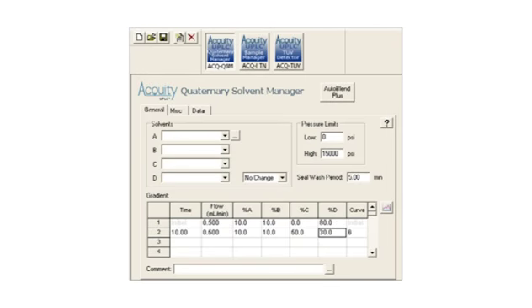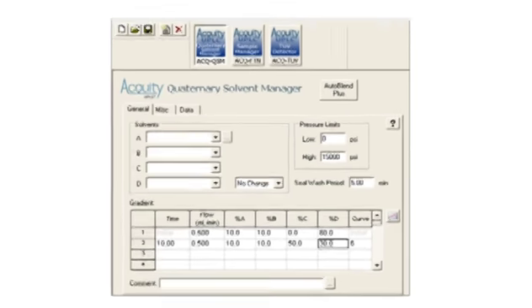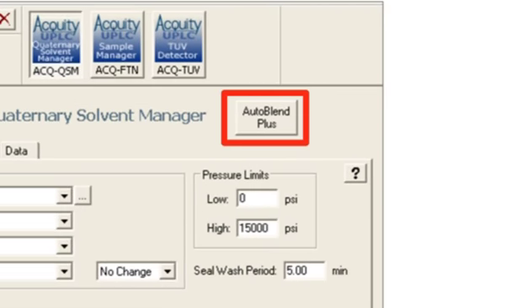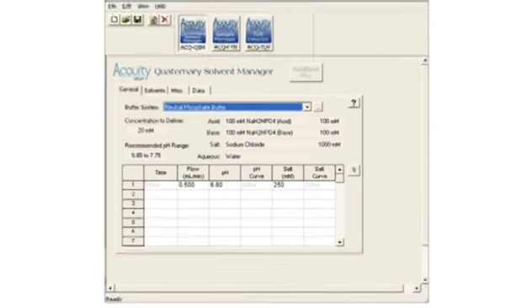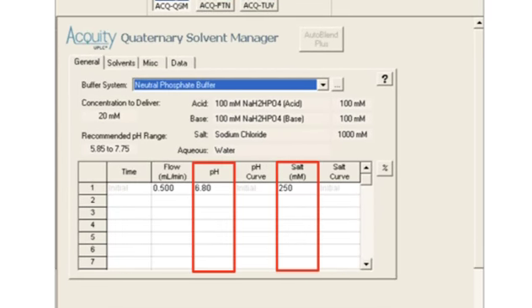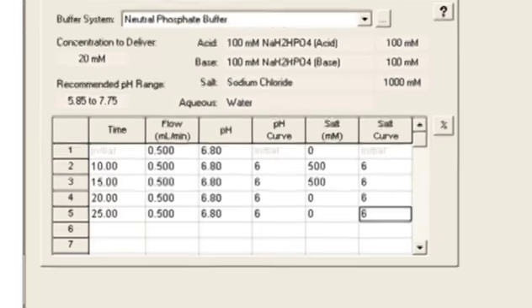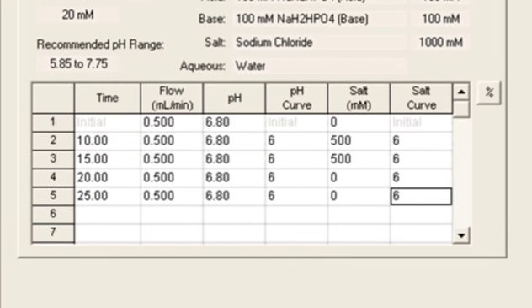Let's go through the steps in using the interface. When we open the instrument method for programming the solvent management system, we find the familiar gradient table used for the Acuity UPLC H-Class system. Notice the additional button labeled AutoBlend Plus. Click this button to move to the alternative method interface. The gradient table is now displayed with columns for pH and salt concentration. Those two values are entered by the user, and the rest of the gradient table is created by filling in the steps that are required. The pH curve and the salt curve are the traditional 11 Waters gradient curves.